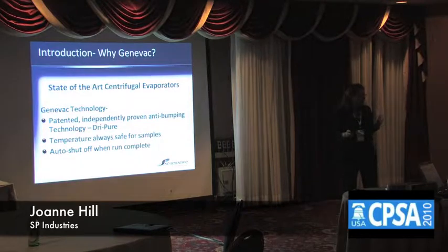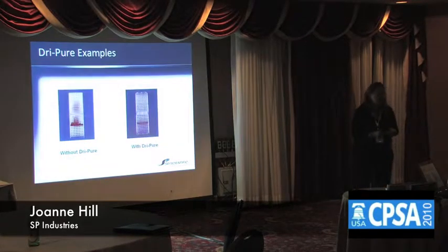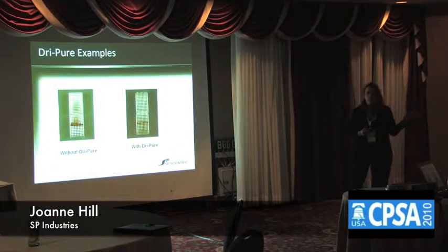Why all the focus on sample prepping? A lot of you are talking about much more sophisticated systems. But as you know, if your samples aren't prepared right, anything that follows isn't going to be worth your time and effort.